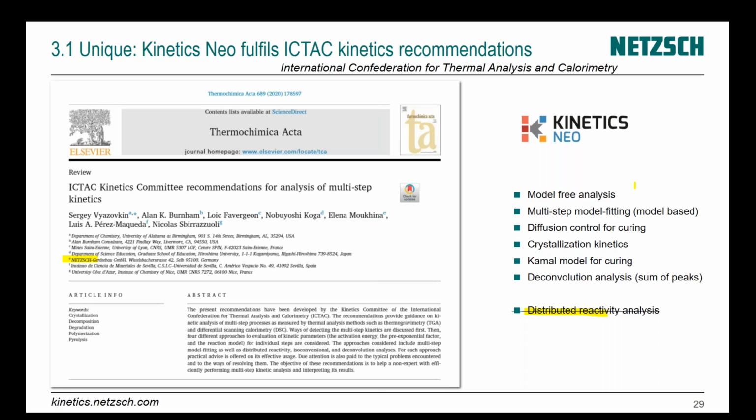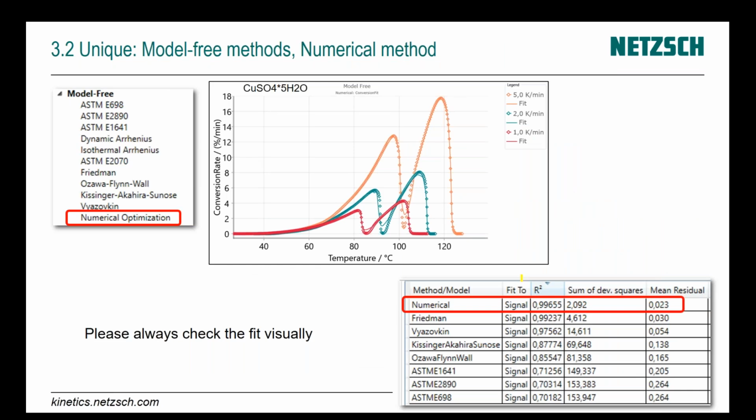Our software includes the following recommendations from these rules: model-free analysis, multi-step model fitting analysis, diffusion control, crystallization, Kamal modeling for curing, and deconvolution analysis, which handles a sum of peaks. A unique feature is a model-free method called the numerical method.